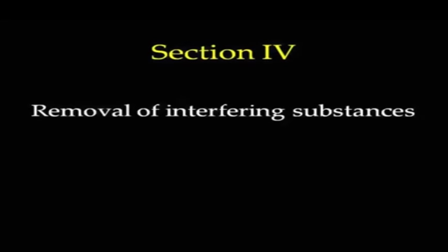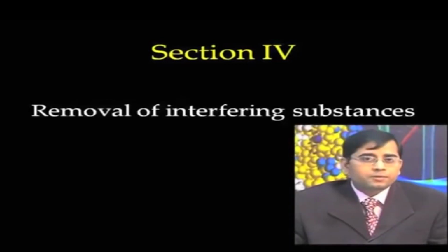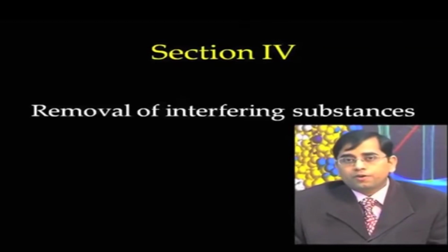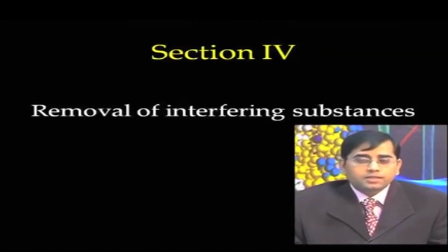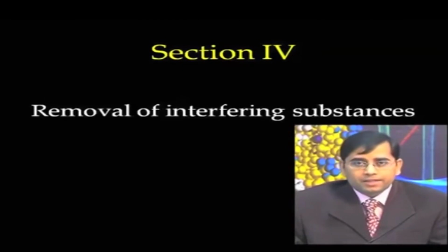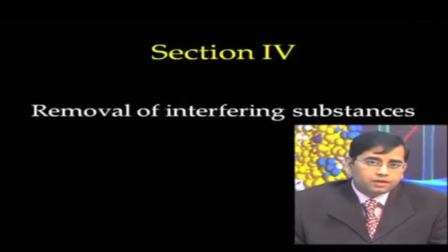So, now let us talk about how to remove the interfering substances, because as I mentioned, the interfering substances are very detrimental for any of your proteomic applications, whether you want to perform 2-dimensional gel electrophoresis, or go for directly LC-MS based applications, or you want to do surface plasmon resonance label-free proteomic techniques, or you want to apply on protein microarrays.